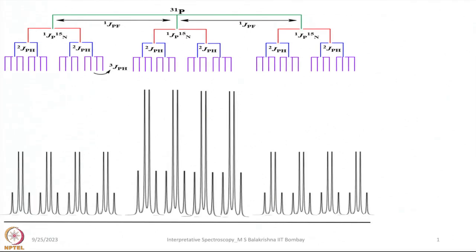Very interesting molecule, right? And the spectrum also looks wonderful. So very nice one. As I said, once you write a clear structure, even if only the molecular formula or structural formula is given, try to write the full structure showing all the bonds and then start analyzing all NMR active nuclei, how far they are from the one we are looking into.